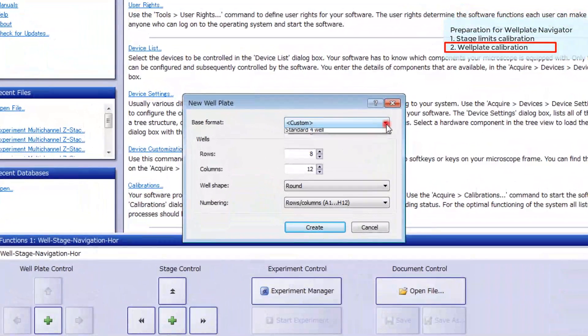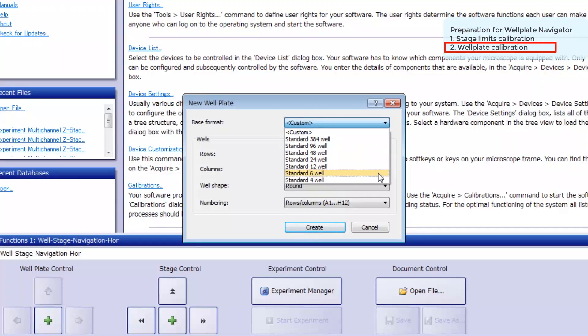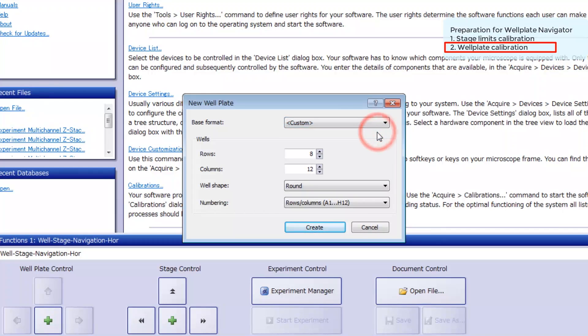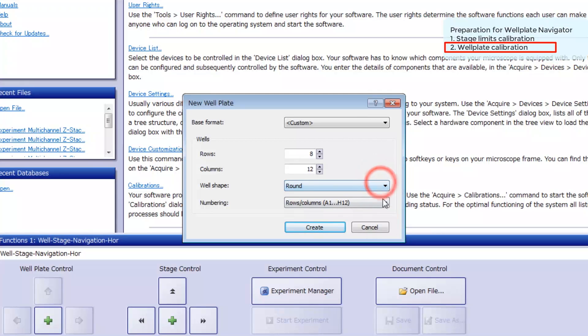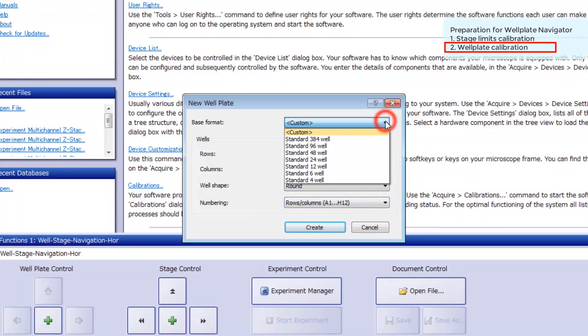You can choose from a variety of wellplates. If your plate isn't listed, select Custom and input the number of rows and columns, the well shape, and numbering. In this example, we'll select a standard 96-well plate and click Create.